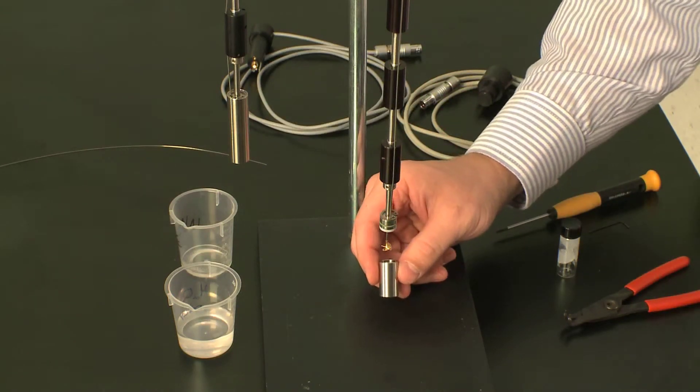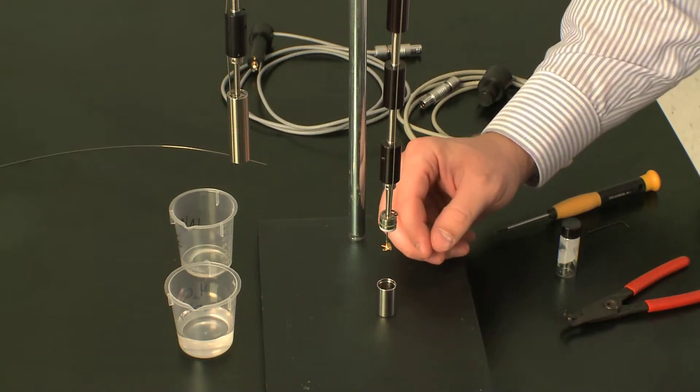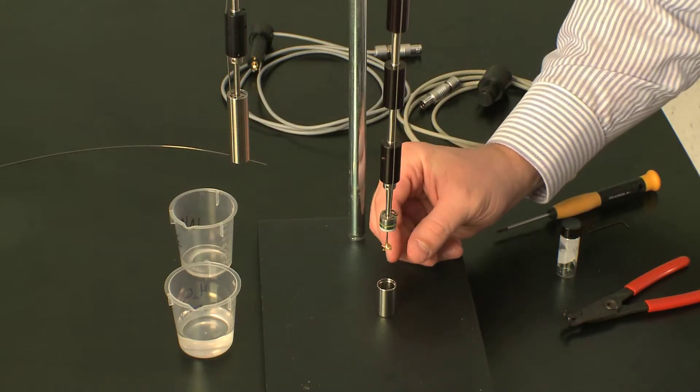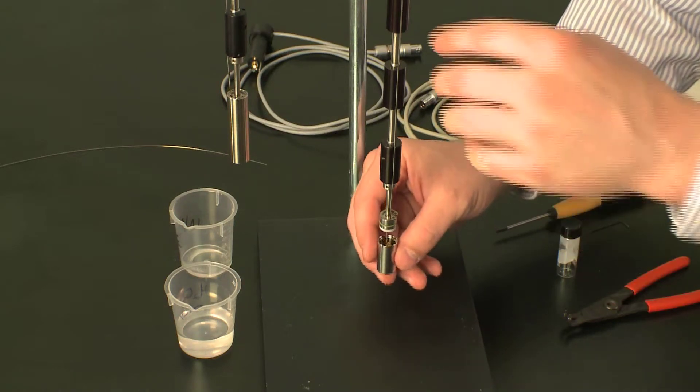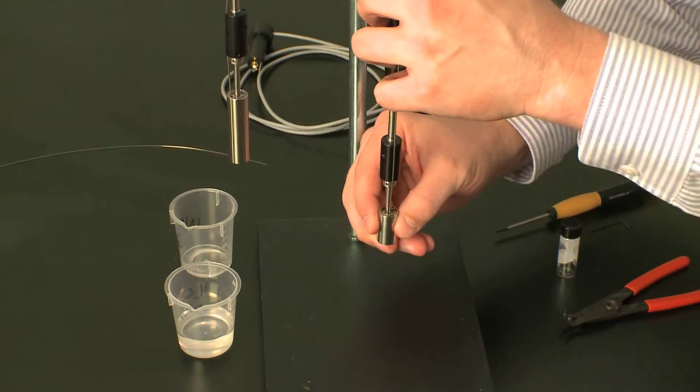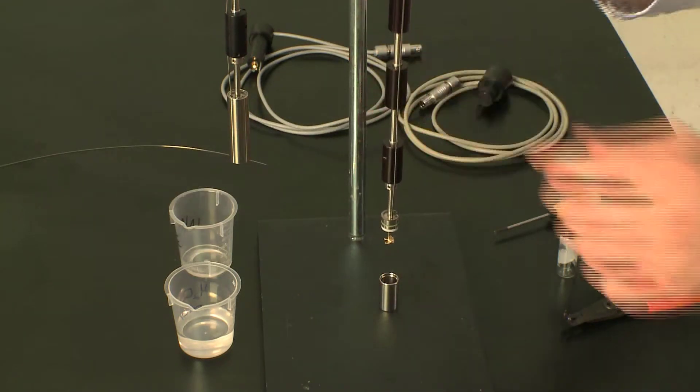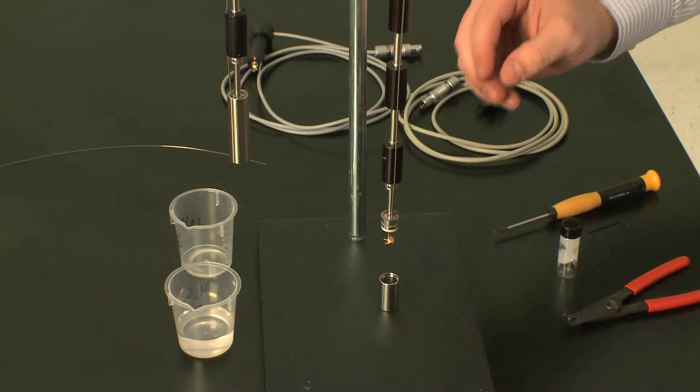Here I'm using a 1 milliliter ampule and the 1 milliliter gold propeller. I've placed the gold propeller on the central shaft. I'm going to put the ampule in place to push the stirrer up. Now I know the stirrer would touch exactly the bottom of the ampule.